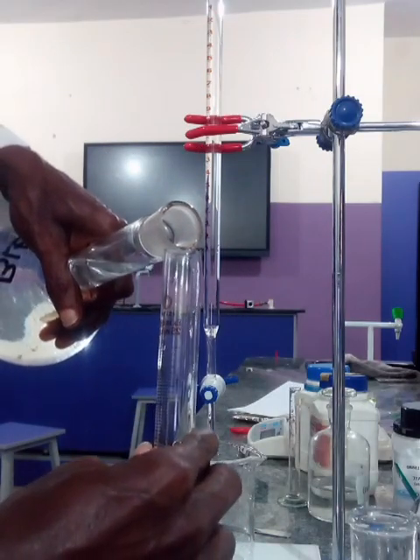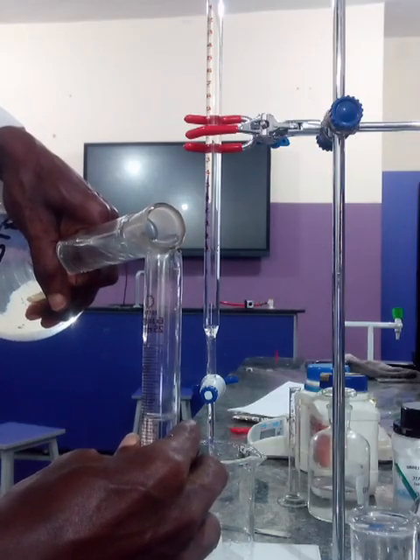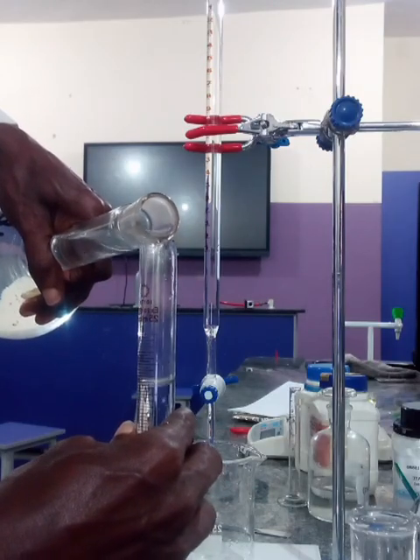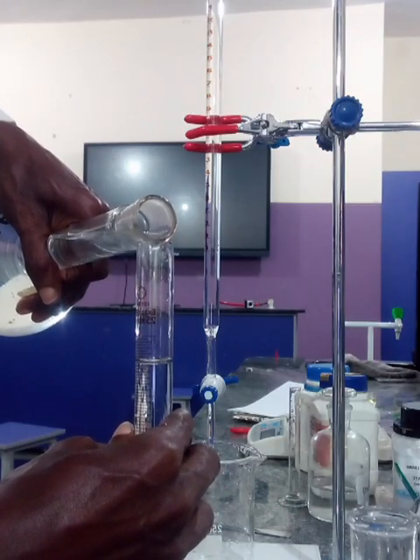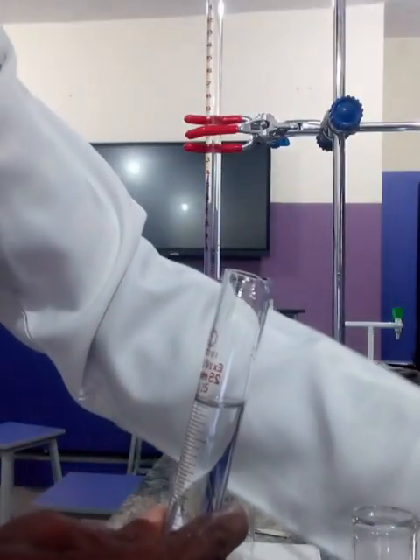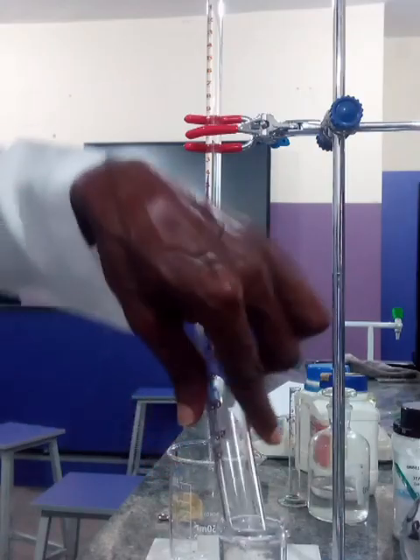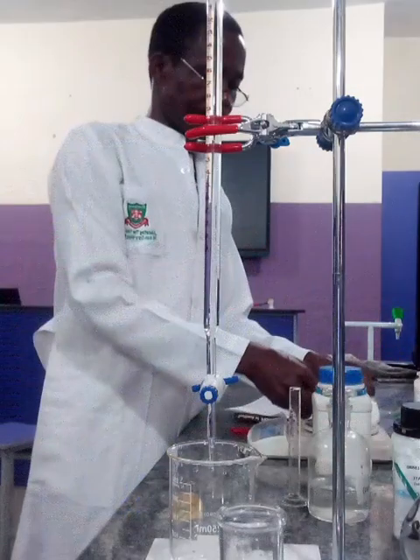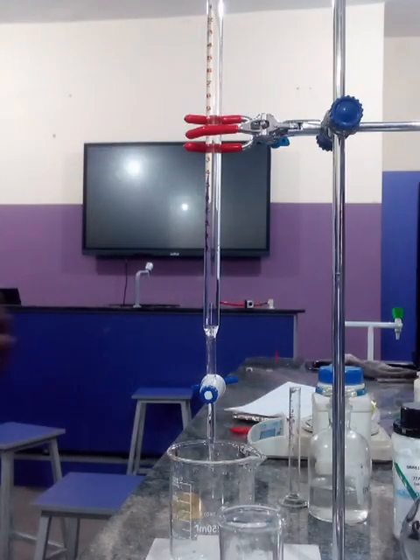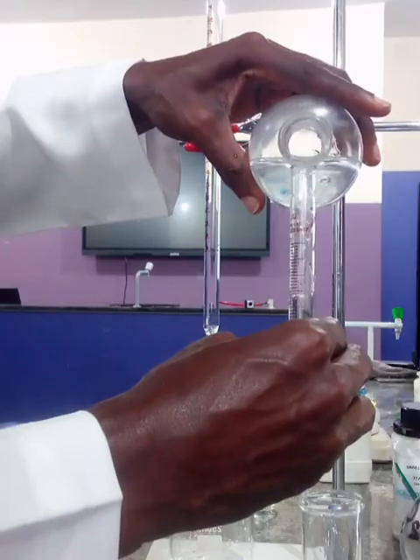Alright, so you need to cover the conical flask and shake the solution. Then after that you add some amount of potassium iodide to the chlorine solution. The potassium iodide will change the chlorine solution to iodine solution. So in your conical flask you are going to have that brown solution, which is the iodine solution.